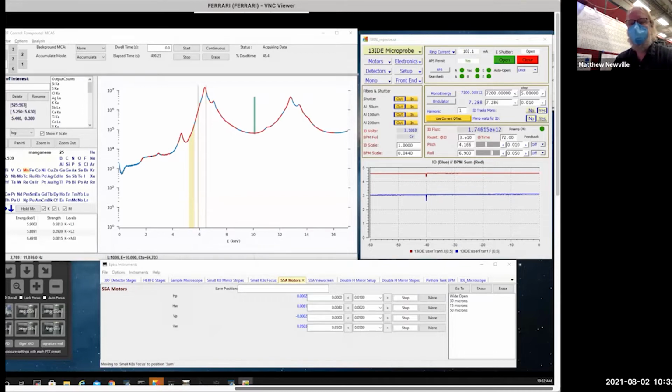So with a range of about 1 to 5 volts, we also want to be able to handle a drop of a factor of maybe 5 or 10. So we've got to get it in the right range. We have some scripts that help you do this, but I just want to make sure that these are set up right.